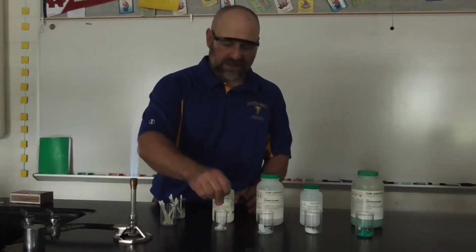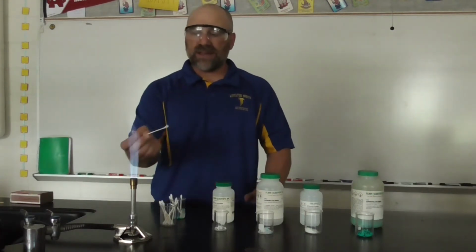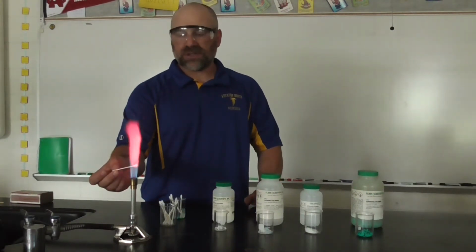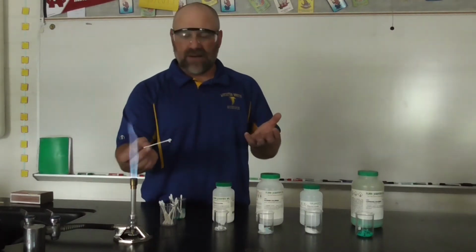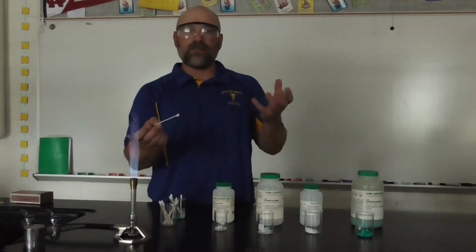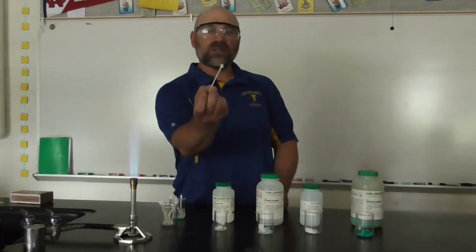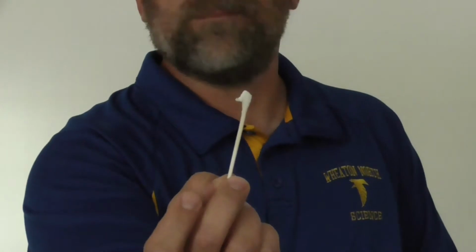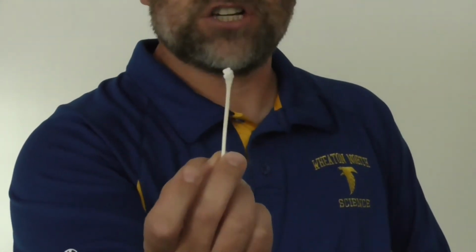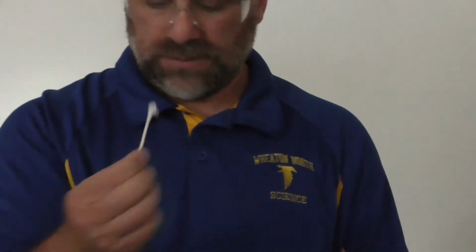So this first salt that I have is lithium chloride. I'm going to take a little bit of it and dip it on the end. You can see here there are some white salt crystals of lithium chloride. When I place it into the flame, the flame is going to serve as an energy source. That energy is then going to cause the electrons in the lithium atoms to jump to higher energy levels and then emit photons as they return back down. Obviously the lithium emits more photons in the red range, which is why that's the overwhelming color that you see. If you look closely, you can see that it's actually not burnt. That's because the salt itself is not combusting. It's not a combustion reaction. The atoms in there are just becoming energized and then releasing that energy as photons of light, the ones that are part of the visible spectrum that you're able to see.